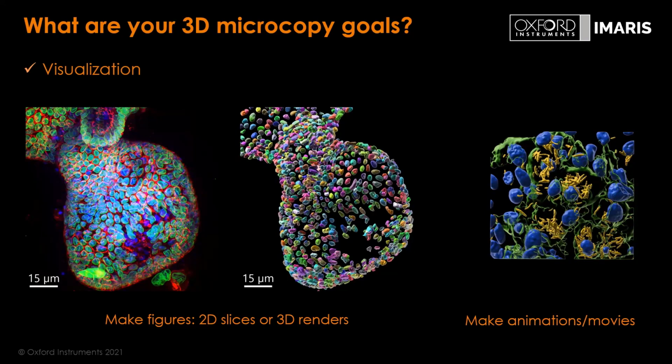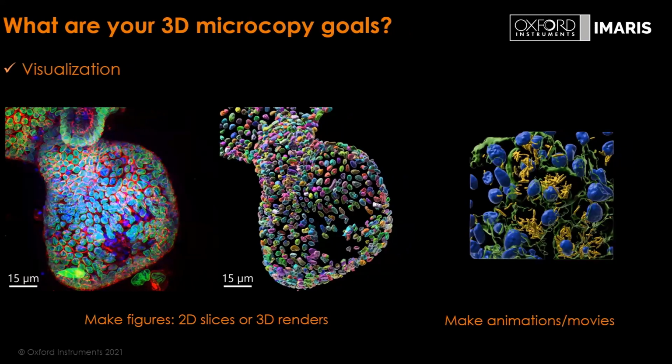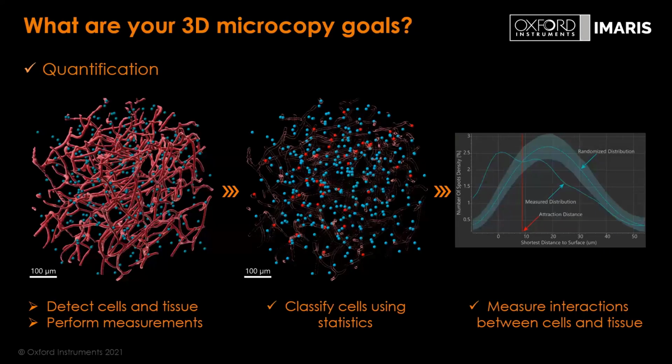This is all great and nice, but on the other hand, what people want to do on top of visualization is quantification: extract meaningful data, meaningful numbers out of your data set. So this is, so to say, the heart of the IMARIS software. This is what I'm going to talk about mostly.